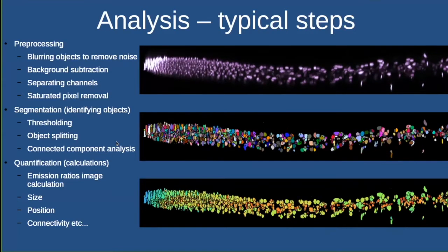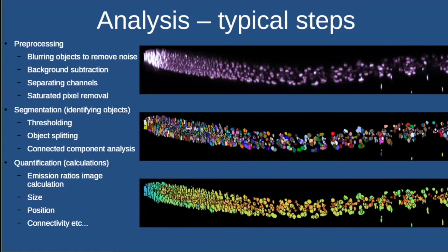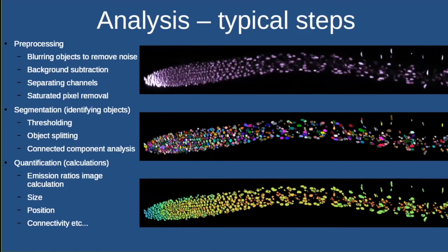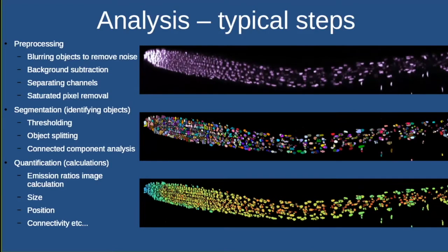And then you perform the quantification itself, which is quite often calculating ratios. But you might also want to calculate, in this case, it's a nuclear sensor, so you might want the size and the position of each of these individual nuclei, or the connectivity of cells or whatever.